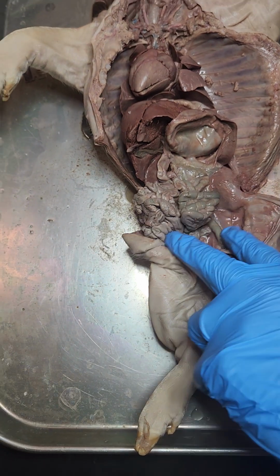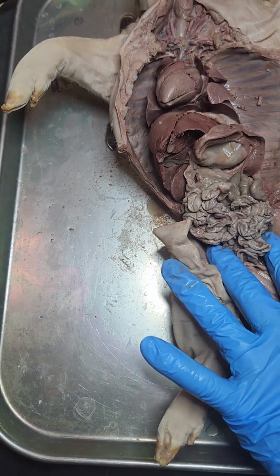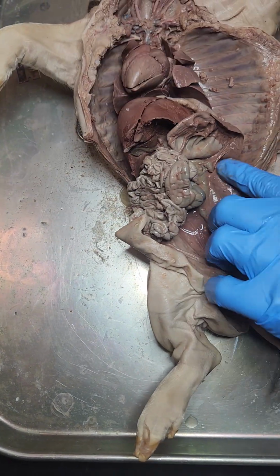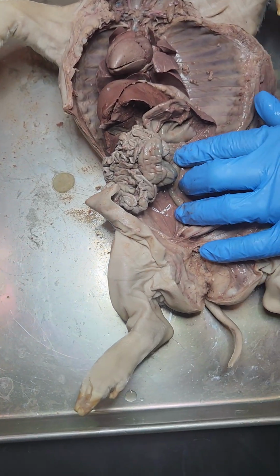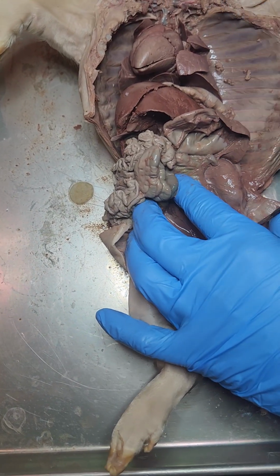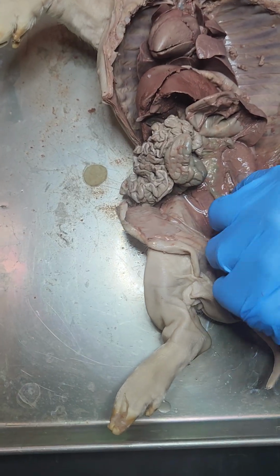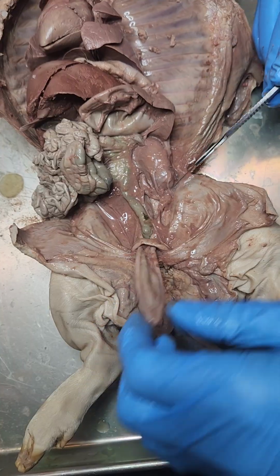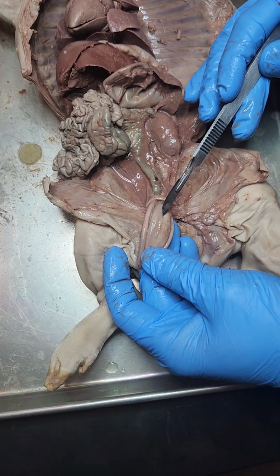Now, the kidneys. How to find the kidneys. If you think about where your kidneys are in your back, you can use these two fingers and follow them up, and you'll find a kidney on each side. There's a kidney, and here's a kidney. Now, when we find the kidneys, we're going to need to find the ureter or ureter. Okay, so we'll clean this up by using the back of the knife here and just sort of move some stuff around. I nicked your colon there, but that's okay. All right, we can find this tube coming from the kidney into the bladder. That's a ureter or ureter, depending on how you pronounce that. The bladder is this right here. That inner portion is the bladder.